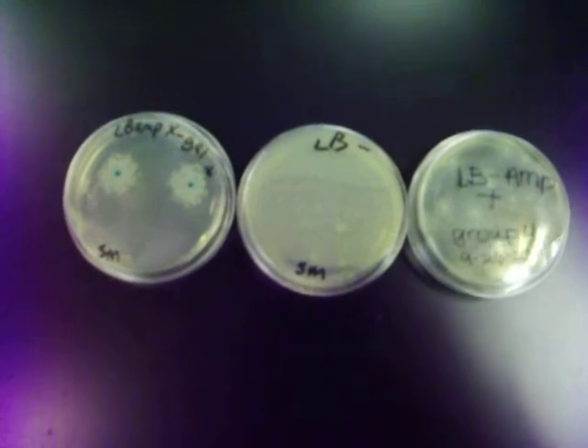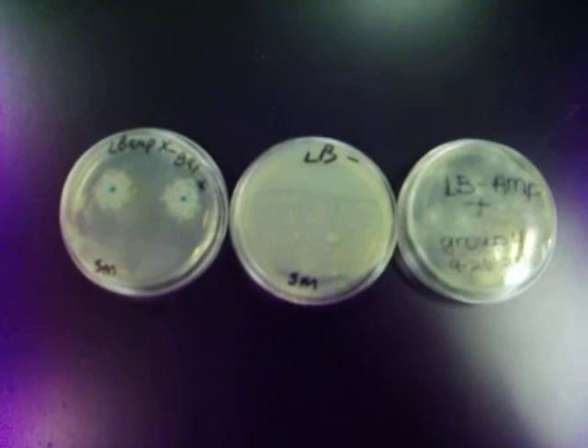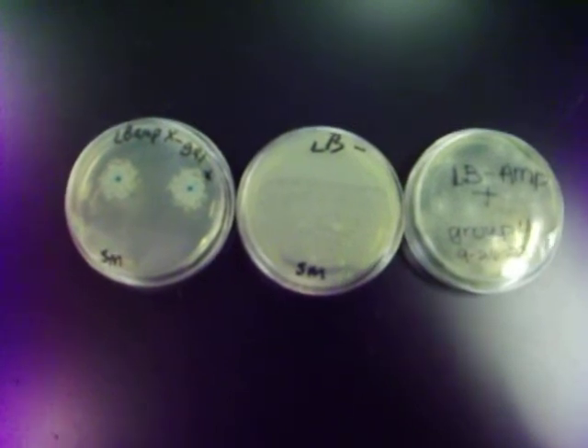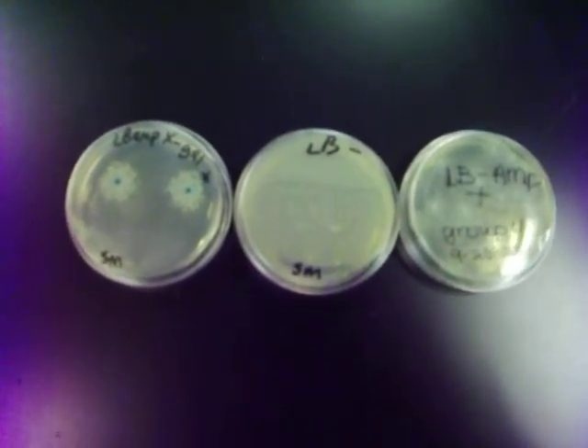And then we heat-shocked it for 90 seconds because 90 seconds gave enough time for the pBLU plasmid to enter the E. coli and incorporate into E. coli's DNA to make it competent, which makes it ampicillin-resistant.